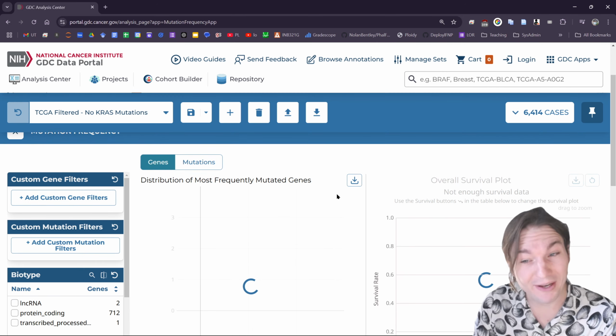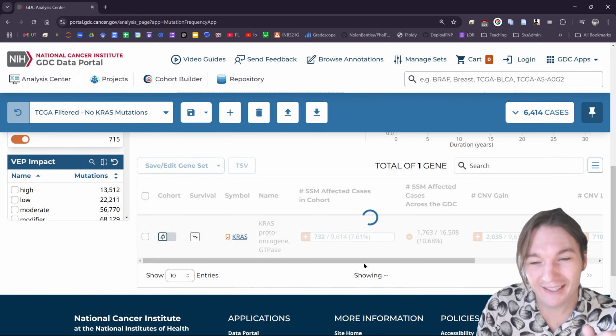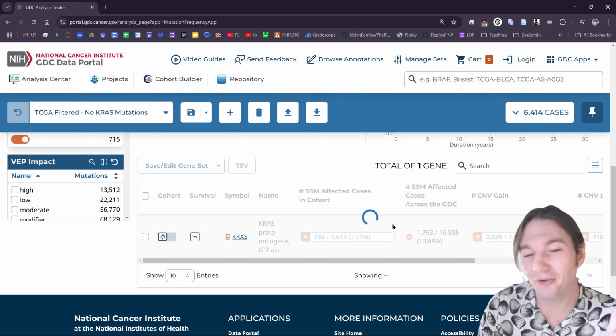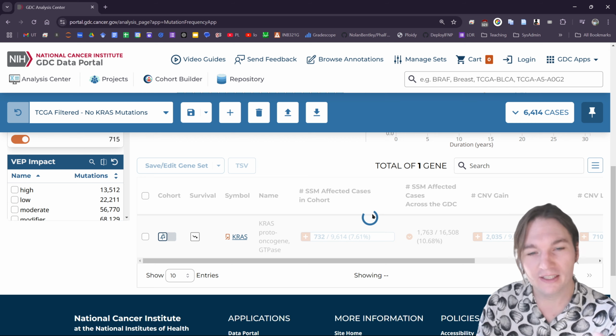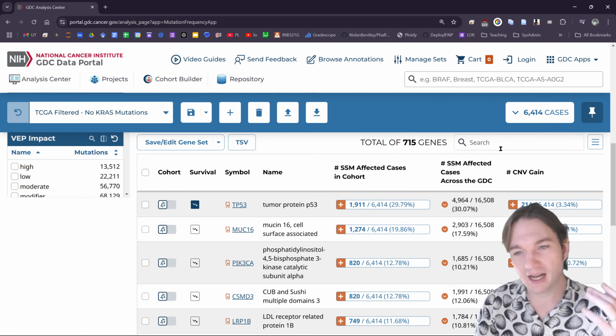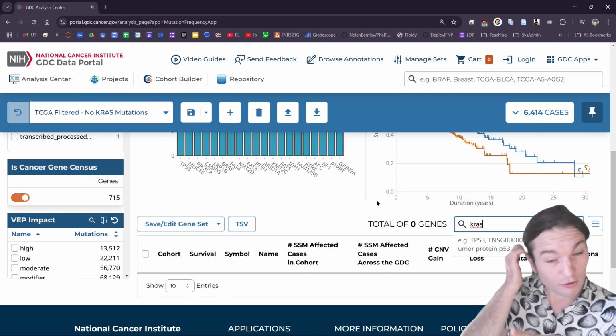I'll be honest, this is the second video I made. I don't know why it didn't work the first time. I probably just clicked something wrong. In the video, I then show that we can just scroll through and keep checking and keep working and messing with the data until we're confident. But I thought it was a little bit confusing enough. Okay, so it does seem to have worked.